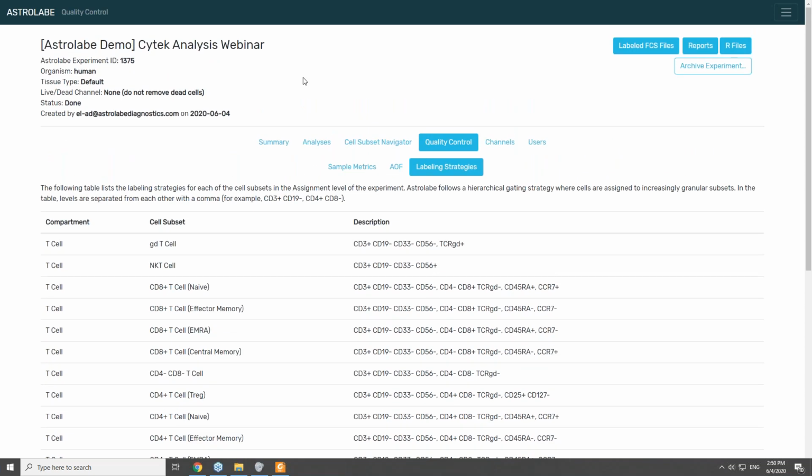One common example is if you have tissue-specific cells, for example, microglia or macrophages, we might not find them by default, but again, we can customize the platform just for your experiment, and it will find it. Again, this process is part of our service. There's no additional charge. It usually takes a few minutes, and we're done.